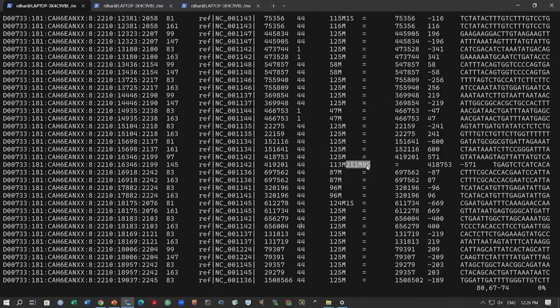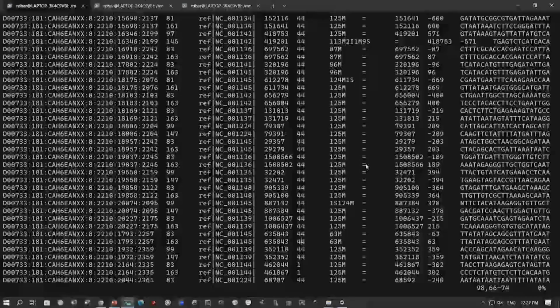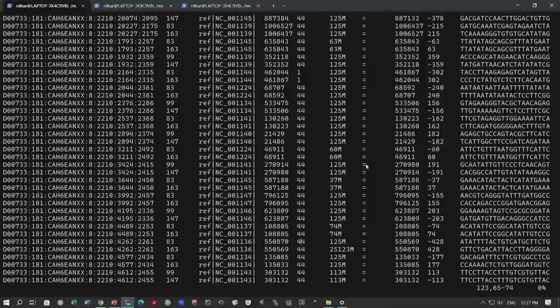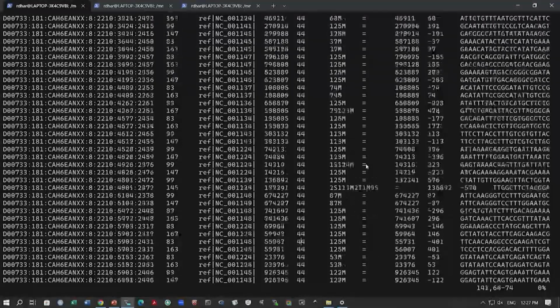So, you would have to actually check very carefully the alignment here and probably want to discard this last part, right. So, whether this alignment actually has worked or not. These 2 insertions they may not be real insertions, because you have this 9 soft clip, means these are not matching. So, the program could not find any match. So, it is removing them, right. So, you would have to be a bit careful when you are dealing with this read alignment. Okay. So, maybe we can search for another example. I will search so that I can show you, right, how this will look like.